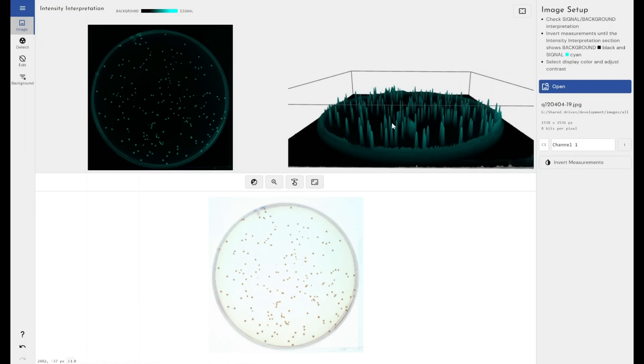If I had an inverted image, for example, these peaks were displayed as troughs and the background was showing up very high as teal, we know that we need to come here and invert this image for the measurements to be taken correctly.